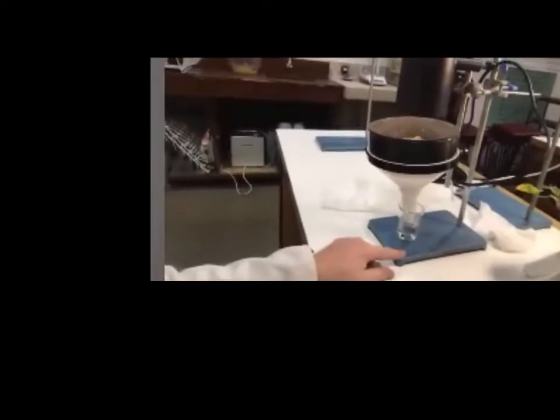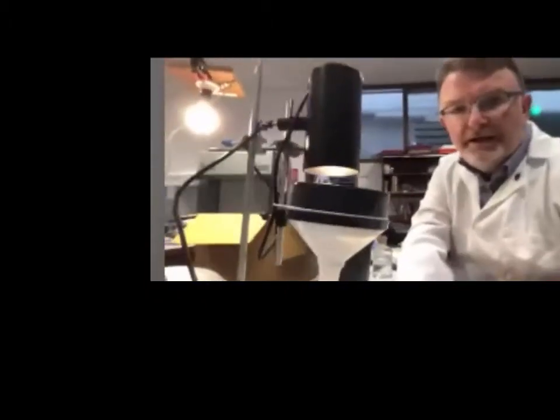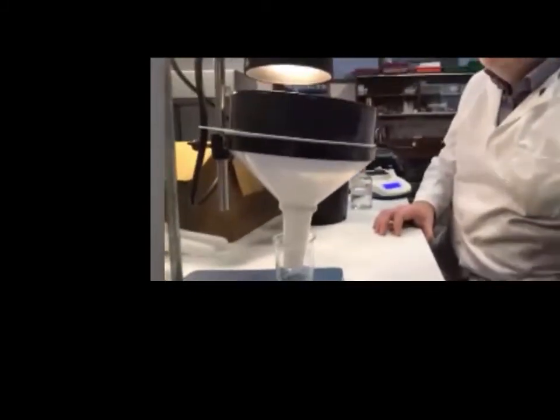So this is one of your experiments set up. That would be one of your mandatory experiments in the ecology section, to study an ecosystem. And you can do it from the comfort of the lab, especially if you get one of the kids to go out and get a cup of soil. So that's number one for today.